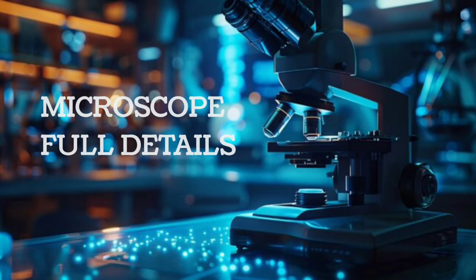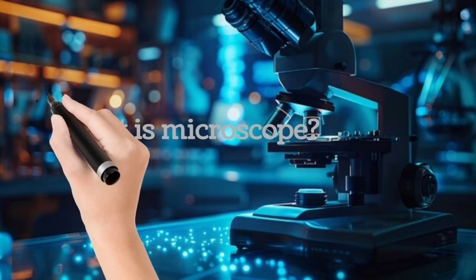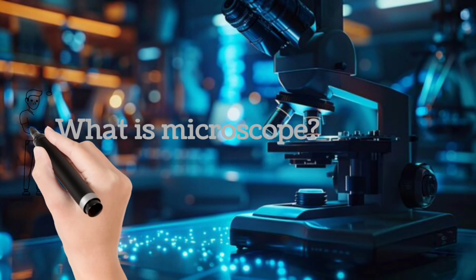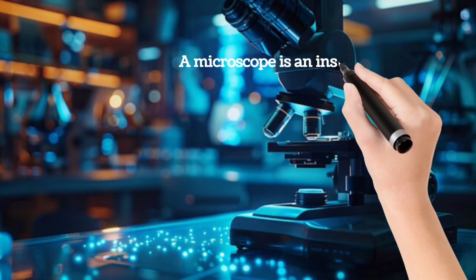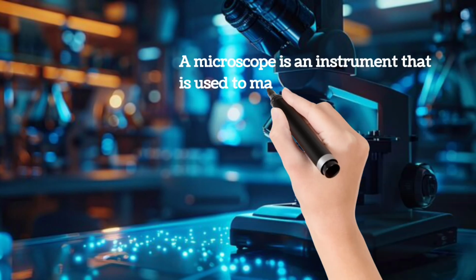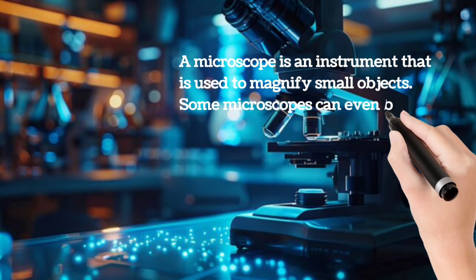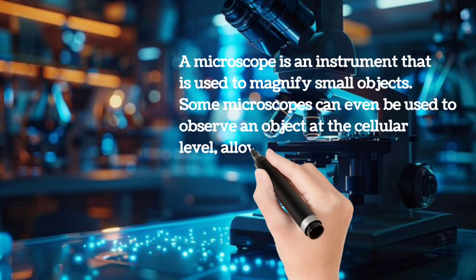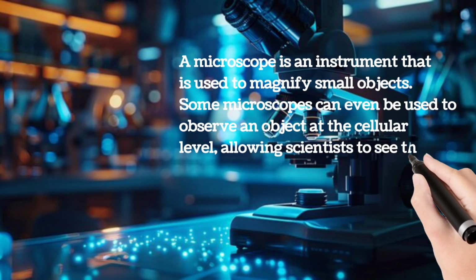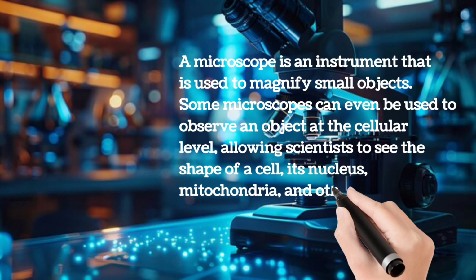What is a microscope? A microscope is an instrument that is used to magnify small objects. Some microscopes can even be used to observe an object at the cellular level, allowing scientists to see the shape of a cell, its nucleus, mitochondria, and other organelles.